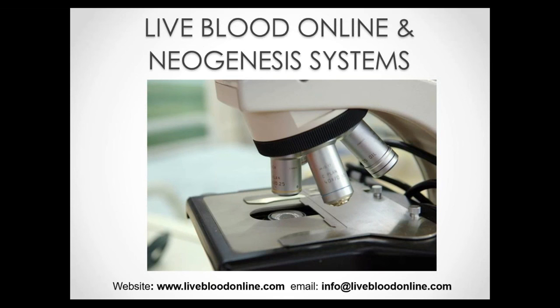Many of the anomalies that we view as being significant in live blood analysis are actually disregarded in conventional testing because they're seen as an artifact created during the staining process or as a result of byproducts of the staining process. Whereas in live blood analysis, because the blood is collected from the finger and placed immediately on a slide and viewed straight away under the microscope, under high magnification, and of course nothing is added, the blood is viewed exactly like it is in the body. So any anomalies that are seen are there because that is the condition of the blood and not because of anything that was added to the blood or how the blood was altered in any way.